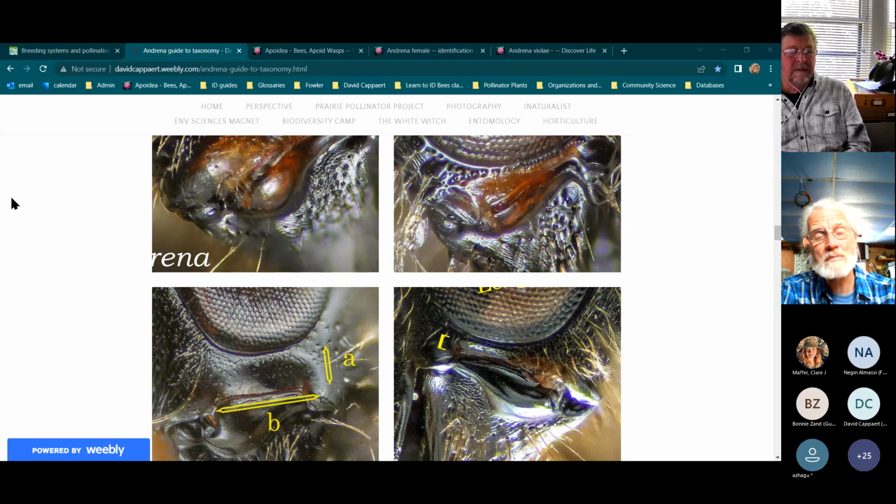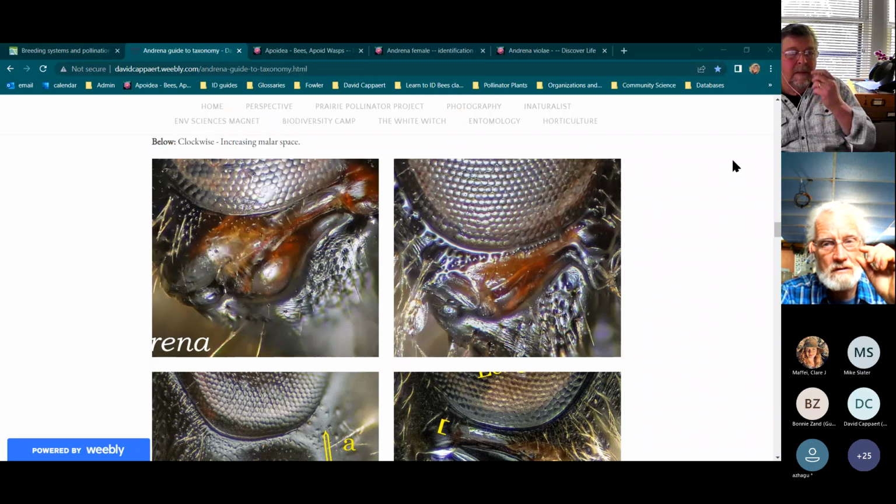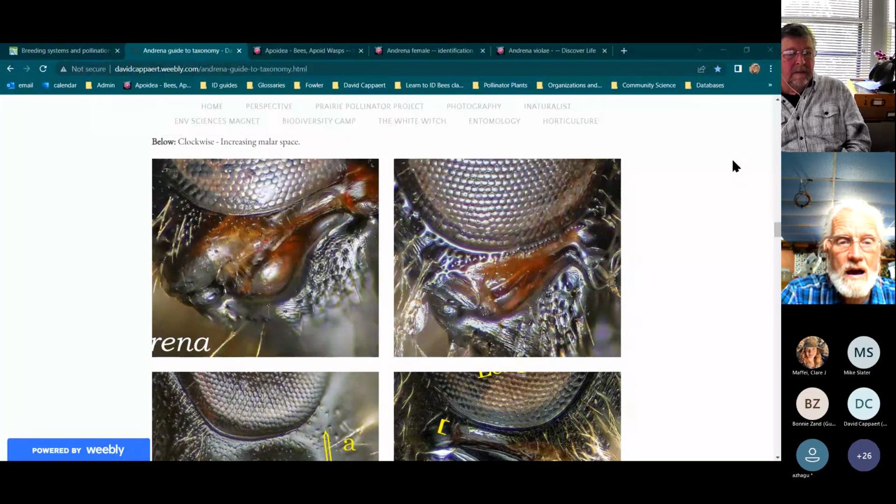Anyway, they did a very good job, and it turned out once they defined it precisely and measured it precisely, almost every species of bumblebee was separable, not just statistically, but actually by that ratio. It was pretty incredible. So here, I think the problem is just that the malar length is not that great. So here we use in the Discover Life one the widths of the eye rim as something convenient.